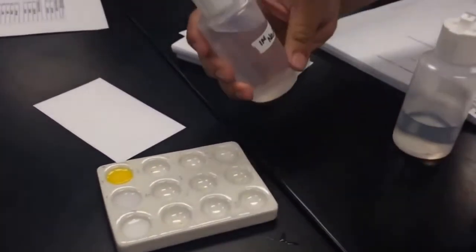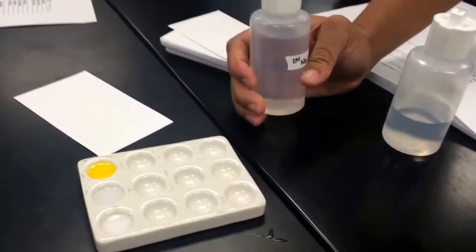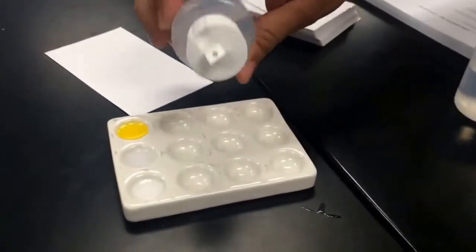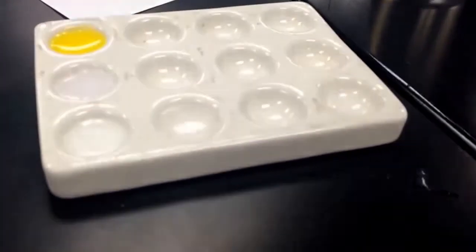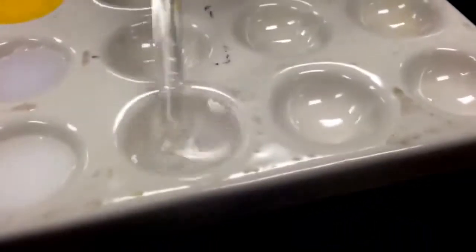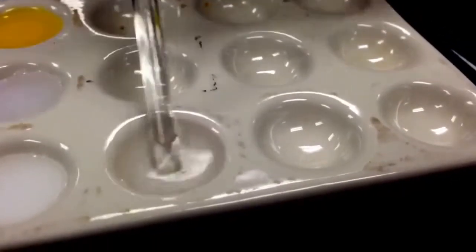The fourth chemicals we're going to mix are sodium carbonate and hydrochloric acid. So here's the sodium carbonate. And here's the hydrochloric acid. Not very much. Oh, there you go. Small white precipitate at the very bottom. Not very much else. Oh, and it's gone.